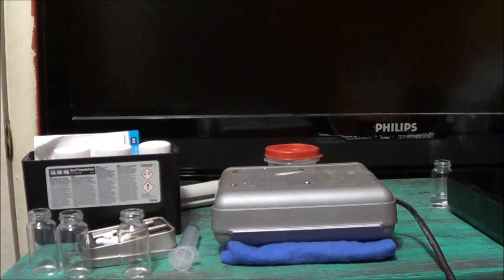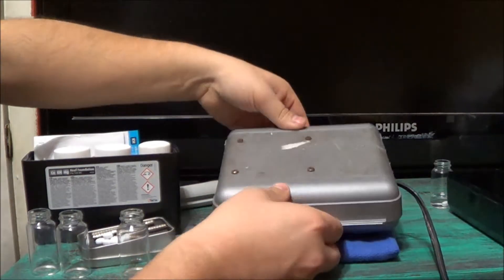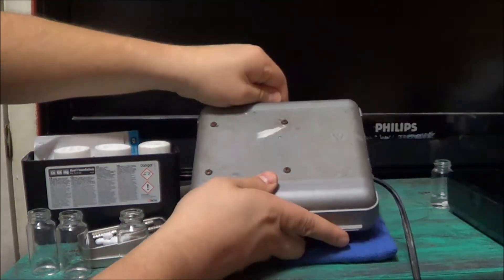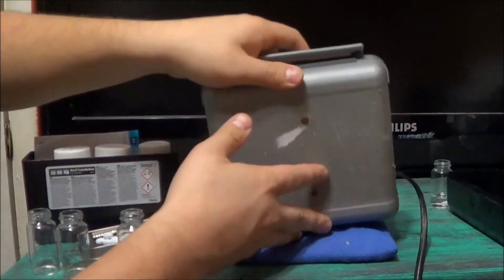All right, well this is me testing out my new magnetic stirrer that I just made. It's just in a little plastic hobby box case, a little dirty from all the stickers on it.